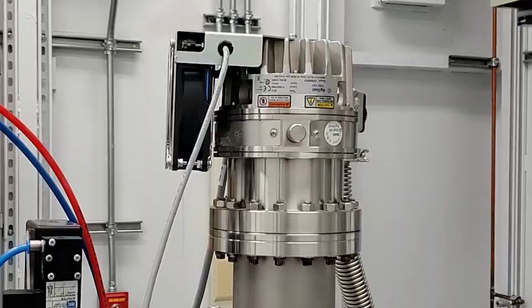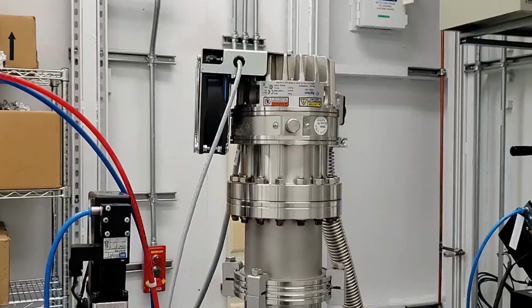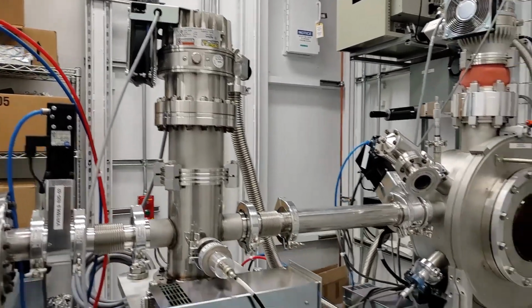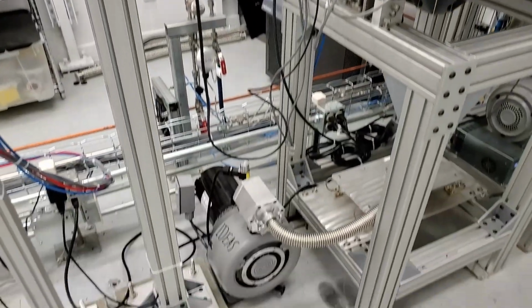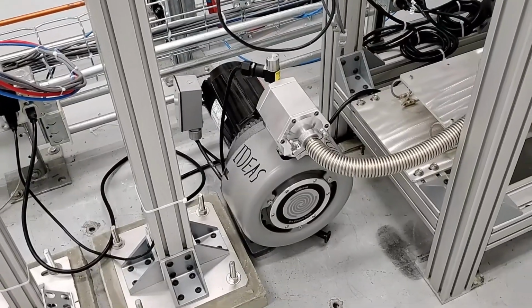They operate much like high-speed turbines, knocking the gas molecules into the back end of the pump, where they collect until there are enough of them to behave like a fluid again. From there, a scroll pump, which isn't a lot different than your vacuum cleaner, is used to suck them out of the system.